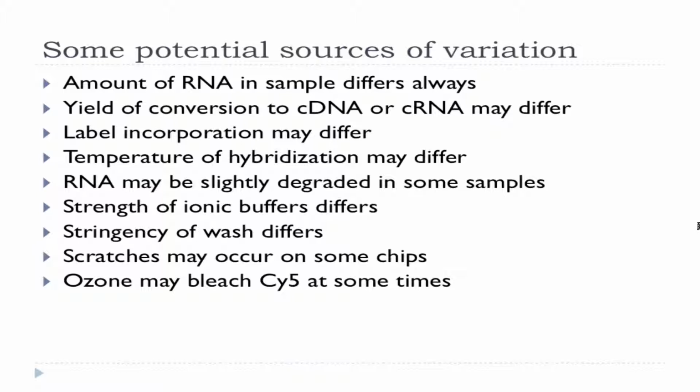The tricky part here is to know when one sample is degraded much more than the others, because that's going to affect your analysis. If they're all degraded the same amount, basically if those degradation plots are approximately parallel to each other, then everything is, quote, the same.